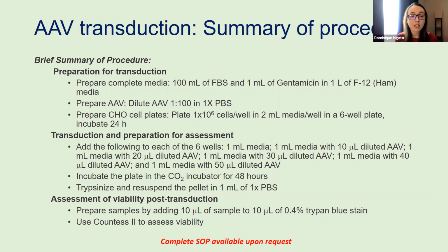But you can see as we move on to the transduction and preparation for assessment that there were several different concentrations tested. These were then incubated with the cells for 48 hours. And then the cells were trypsinized, and we assessed viability as well as the transduction efficiency.